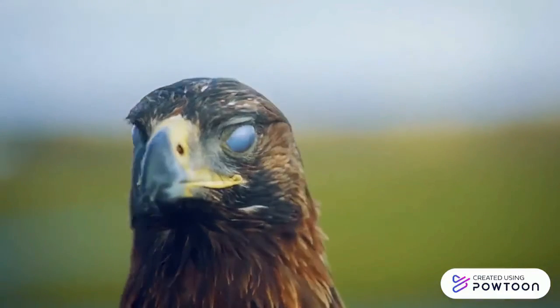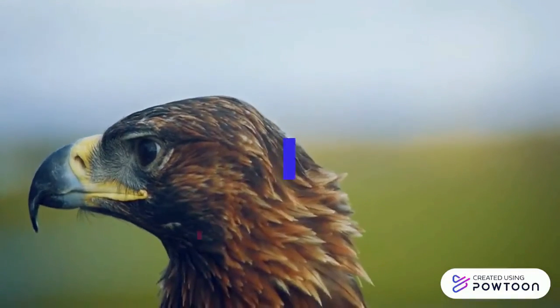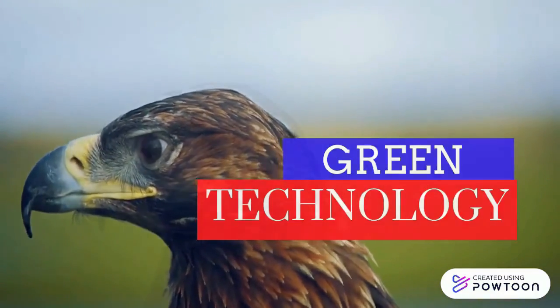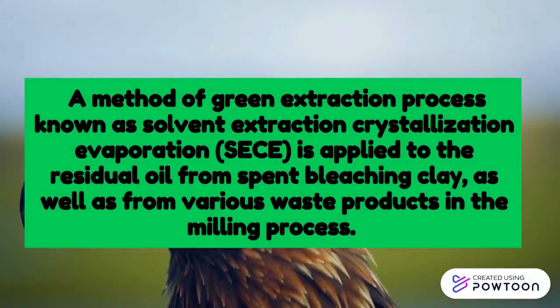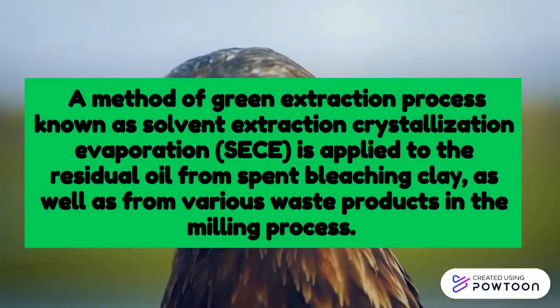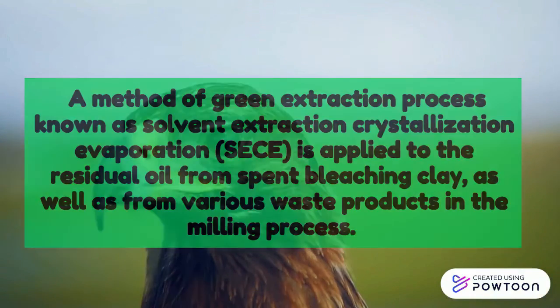My name is Siti Humaira binti Muhammad Jasni and I will be presenting about the green technology. In this part, a method of green extraction process known as solvent extraction crystallization evaporation (SECE) is applied to recover the residual oil from spent bleaching clay (SBC) as well as from various waste products in the milling process.